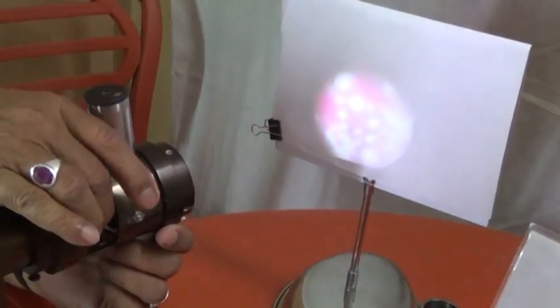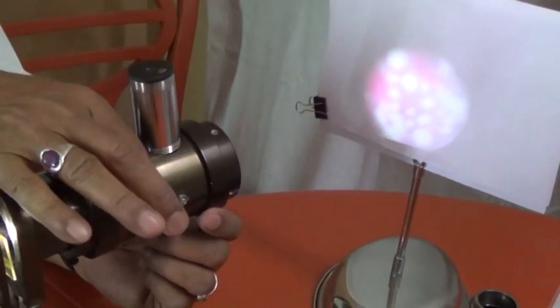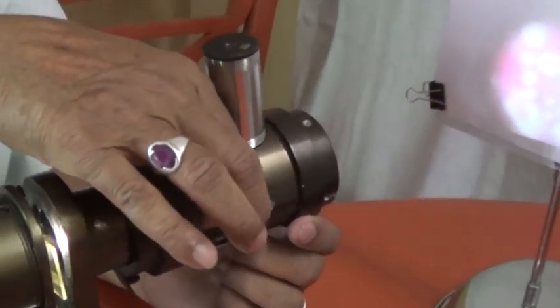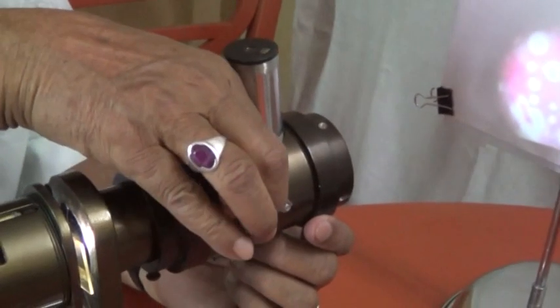The adjusting knob is to be operated to get the clear image. We are viewing the clear image of this specimen.